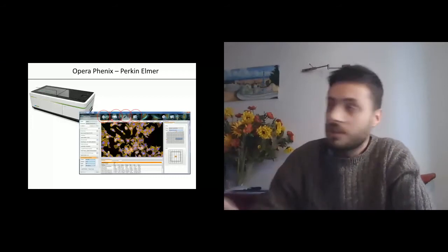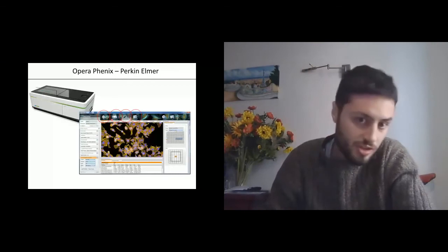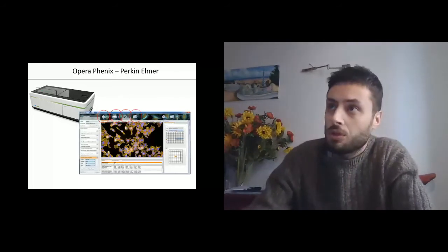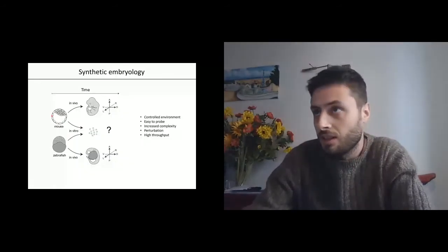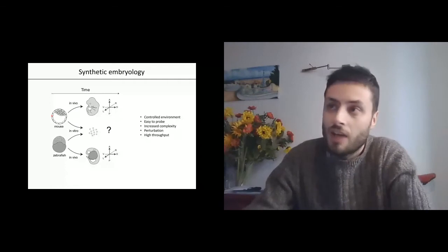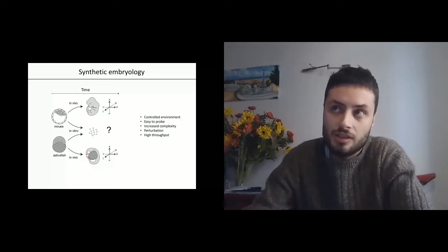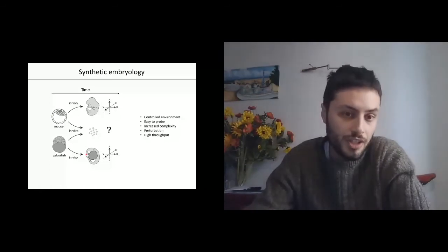We use this system, and I would like to very briefly introduce you to the biological process that we are interested in. In our lab, we study synthetic embryology. In particular, instead of studying how different embryos, different organisms, for instance, in our case, the mouse and the zebrafish, develop in their actual maternal environment, we use embryonic stem cells, which are taken out of their maternal environment and then cultured in a dish, so in vitro.